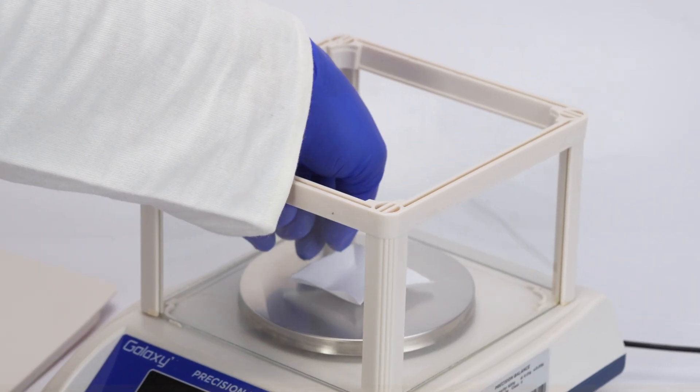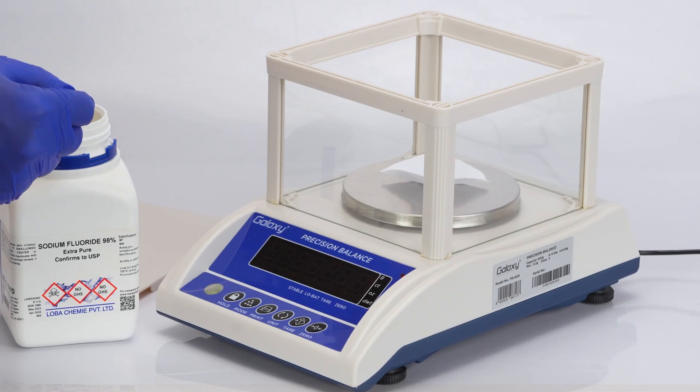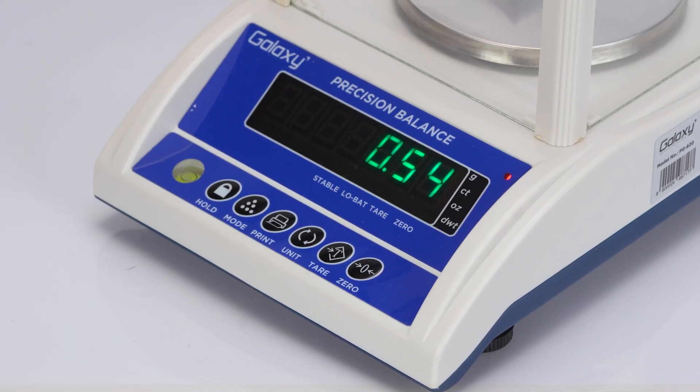To weigh a salt sample, place weighing paper on the pan and press the zero key. Add the salt sample to be measured and wait for the stable indicator before reading the weight.